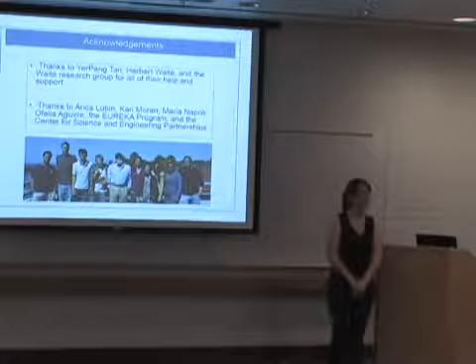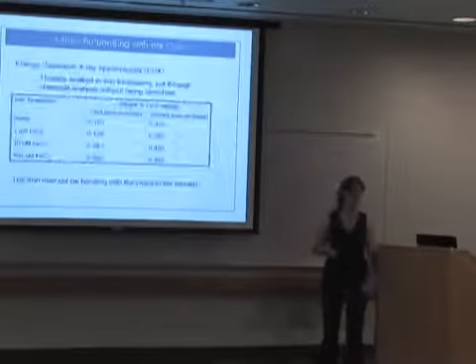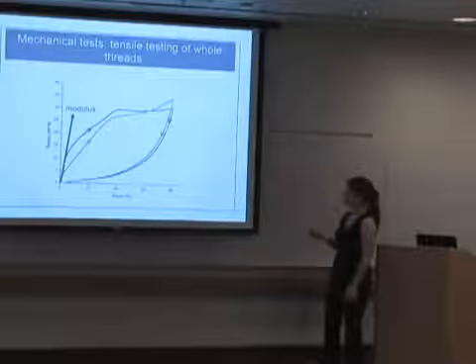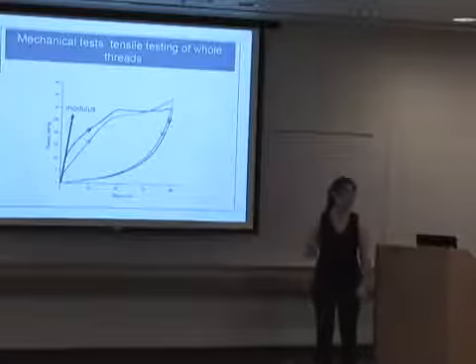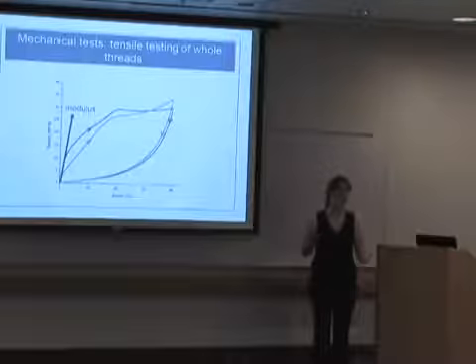Yes? When you did the testing, did you actually break the strands at the end? Well, when I was taking them out of the machine, I did, yeah. Okay. But not for the actual measurements, because if it was actually breaking, the strand would look like it had stretched, and then it would keep going, and then it would just drop off from when it broke. Right. Yeah, so I wanted to stretch it to the point where I could see the peak stress point, but I didn't want to break them, because I wanted to observe how they could recover in between cycles.